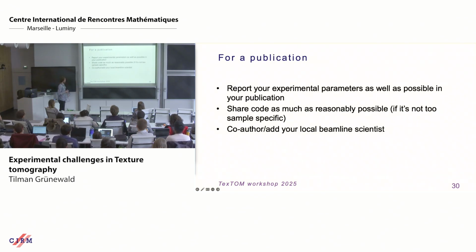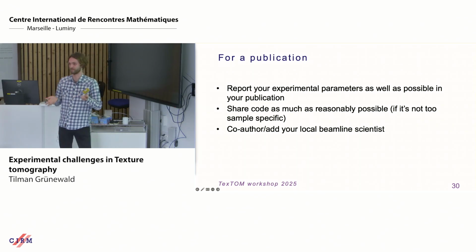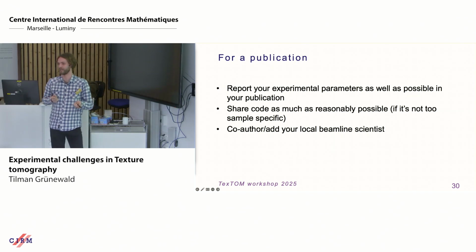When it comes to publication, of course, report as much as possible, share your code as much as reasonable, and also add your Beamline scientists or acknowledge them at least. It's really important for the synchrotrons to get that back. I mean, they put all this work into the beamlines you're working on, that's 10, 20, 30 years of work that has been going, and you kind of profit from all that. So the bare minimum we can do is really give them the publications back.